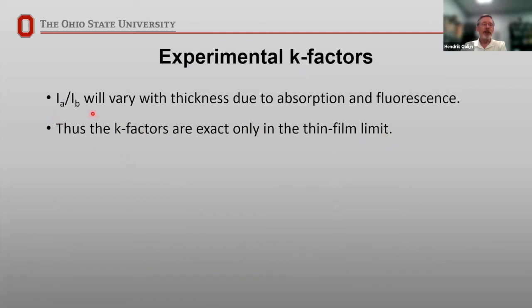So since you do have to sometimes think about absorption and fluorescence, you do need to know that your intensities will vary with thickness, because you do have some absorption and fluorescence. And you can calculate at what point you violate what we call our thin film limit.